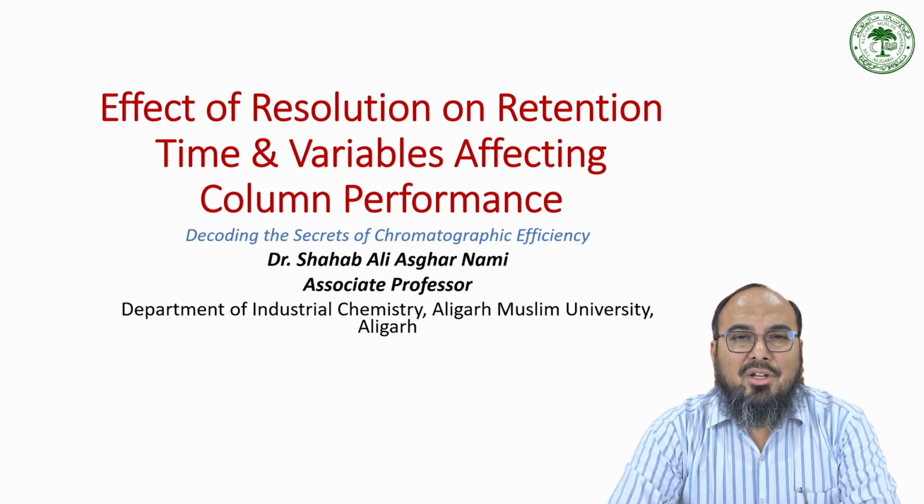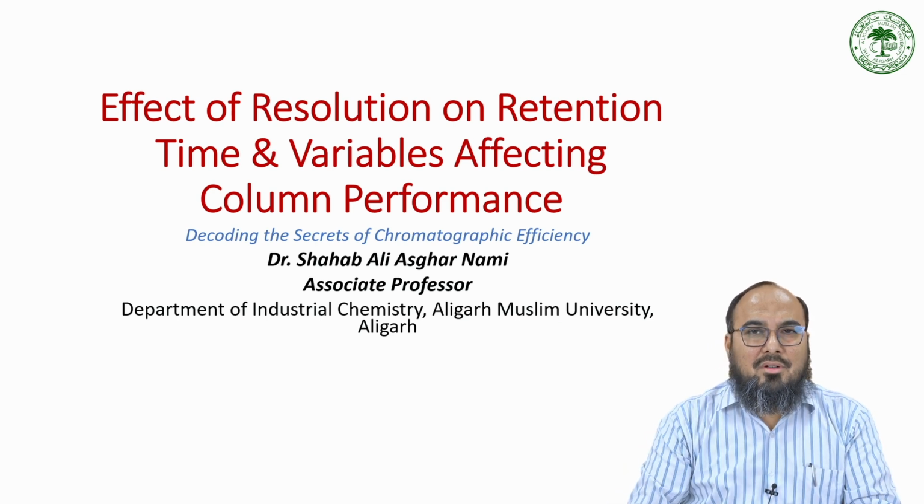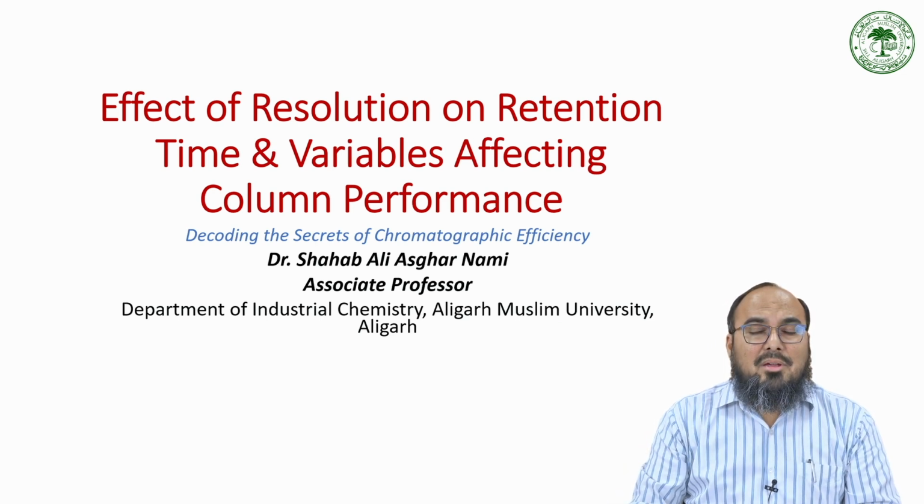Now we are on the last part of the chromatography section, and today we are going to discuss various effects of certain factors on the resolution, and we are also going to see certain individual parameters which affect the column performance in terms of its resolution. So let us begin our journey.